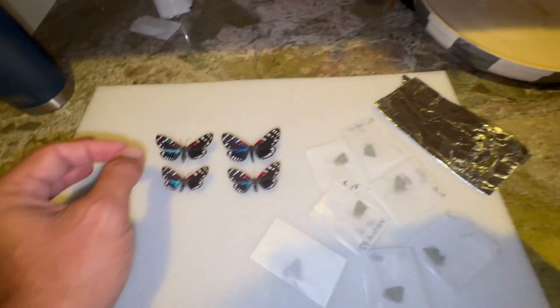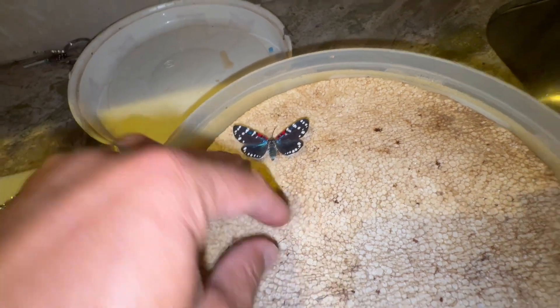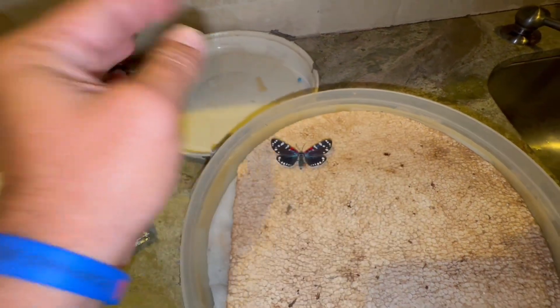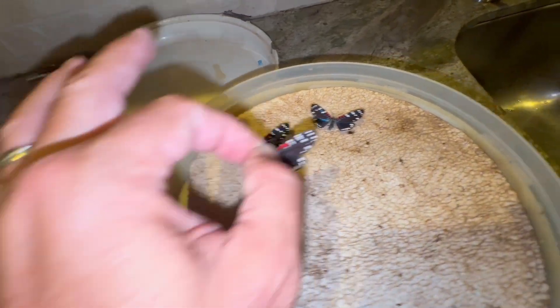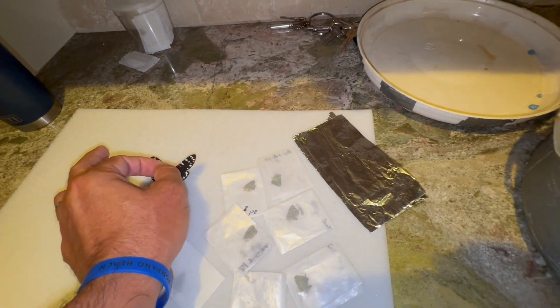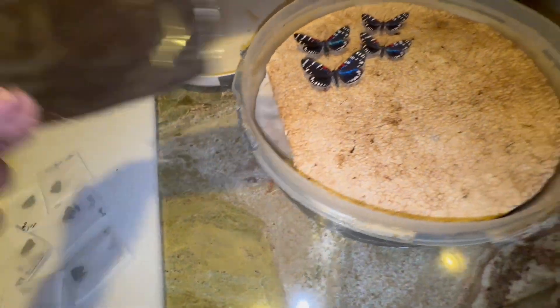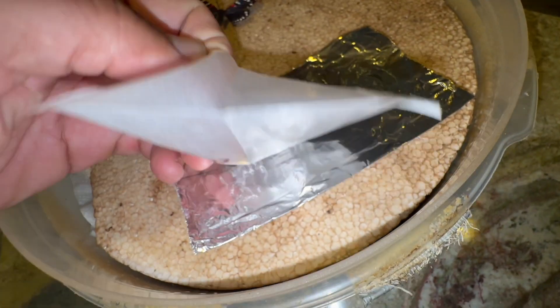With the pin specimens, I'm going to go ahead and just pin them in. I'm going to stick them into the styrofoam fairly deep because when they start to rehydrate, the wings will start to fold up. We don't want them to hit the container. I'm going to put a piece of tinfoil here and place my hair streak specimens on that. Look at the olive hair streak — they're stunning!